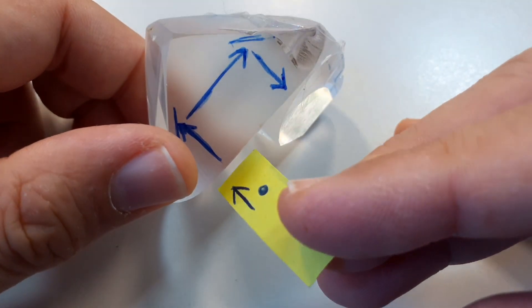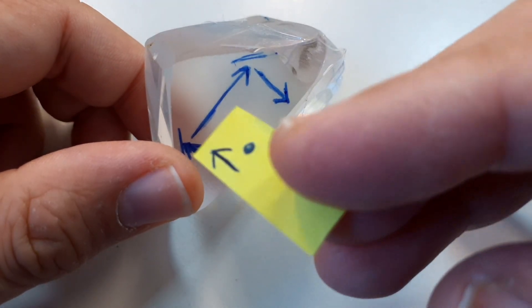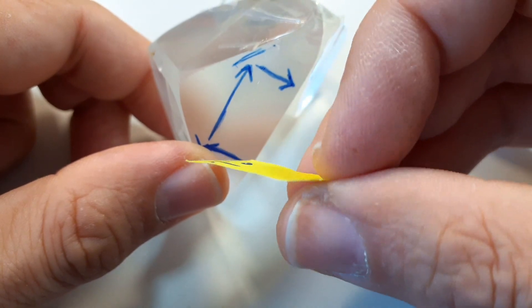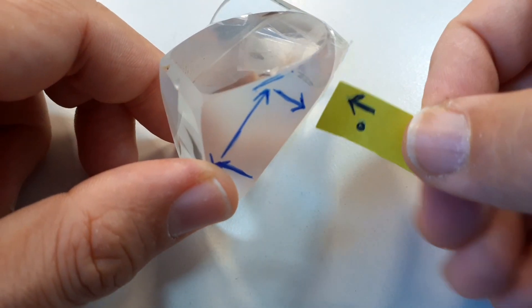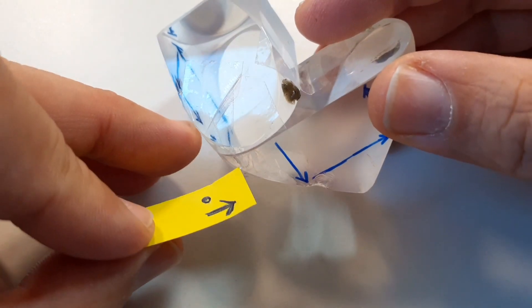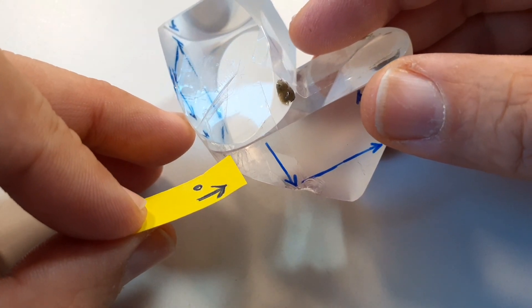So it enters with the arrow pointing upward and the dot on the right. And it's reflected by the first surface like this. And it's reflected again. And now you can see as it exits this first prism, the dot is now on the left side.